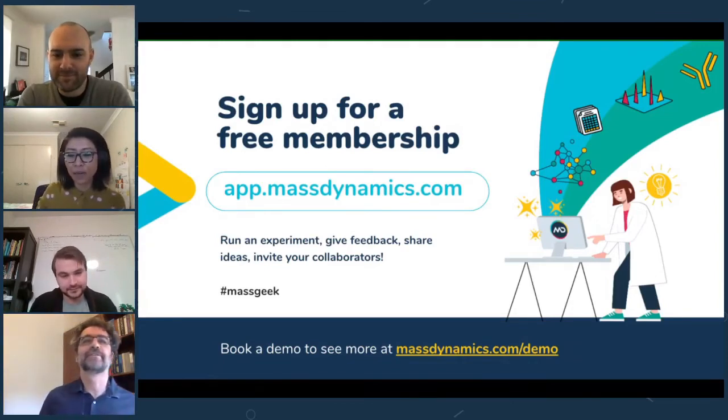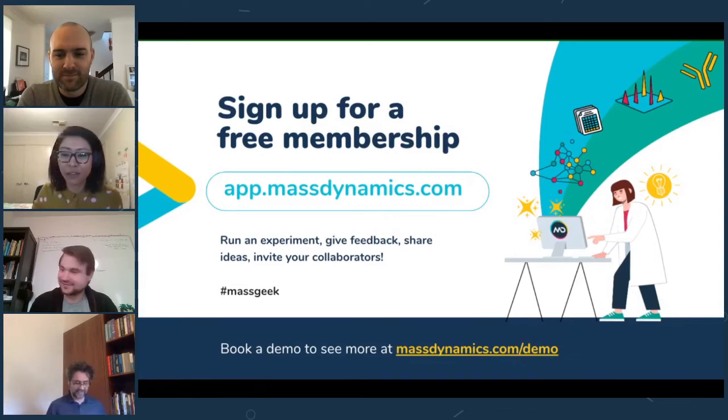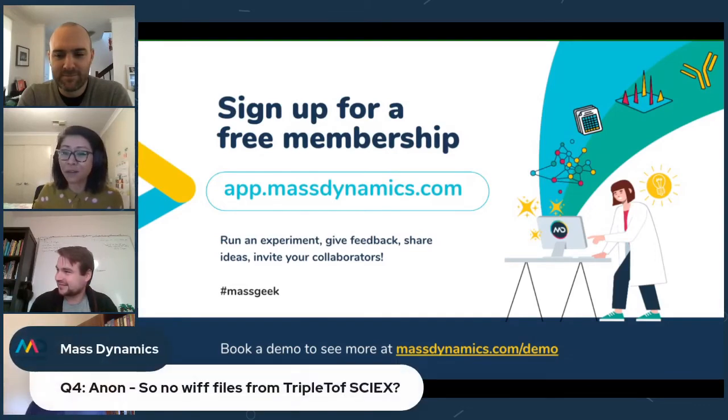Fantastic. Okay, there's one more coming through. Please keep them coming, this is fantastic. We've still got 15 minutes of time here. It's from Anonymous: no WIFF files from triple TOF SciEx? That's a new feature request.